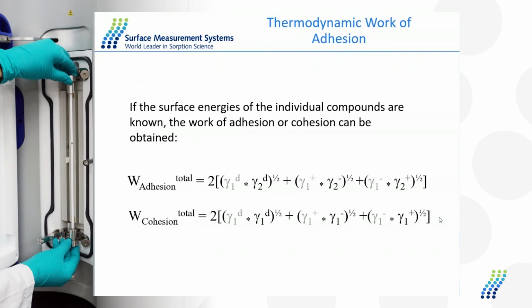with that. So for most of the time, what we recommend is probably using heptane C7 up to C10. So heptane, octane, nonane, decane as a place to start, and then you would have to adjust accordingly.